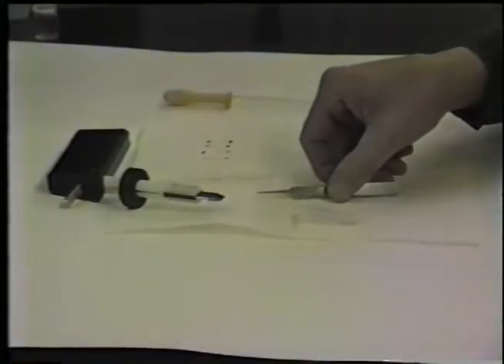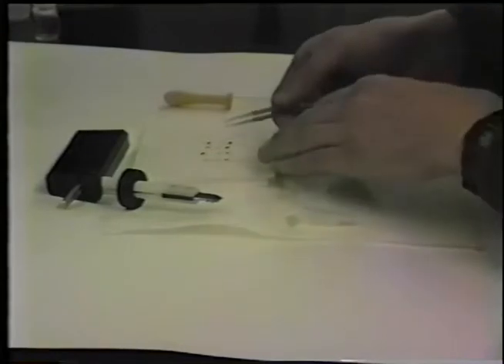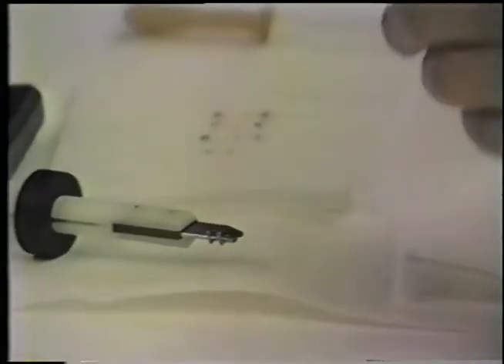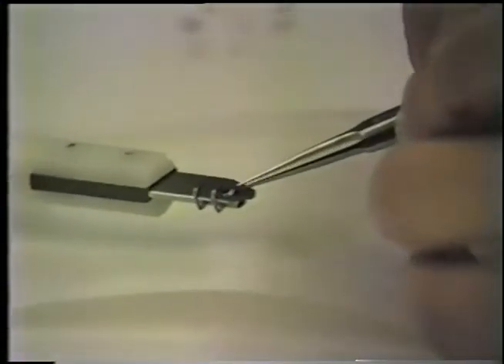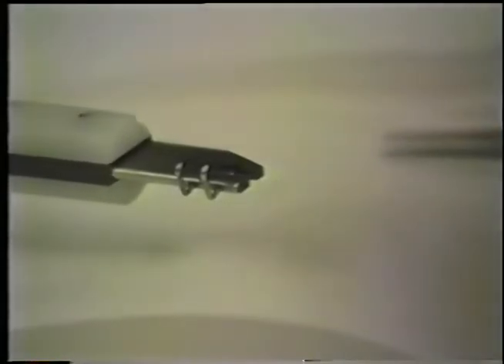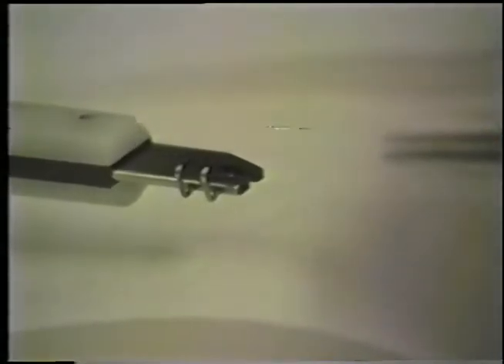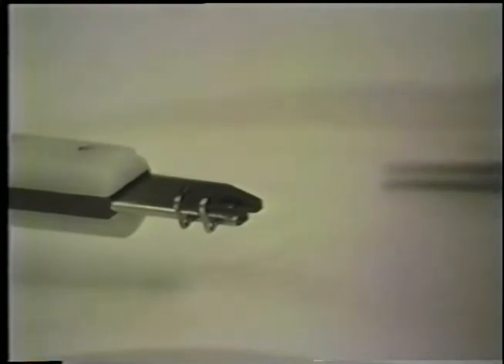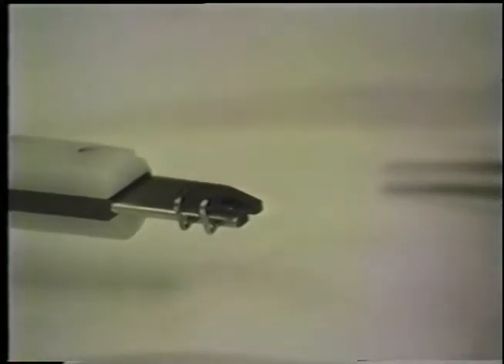To prepare a sample for freezing, first pick up one of the metal specimen carriers and place it in the sample holder. We then get a small aliquot of the sample with the Pasteur pipette and apply it to the specimen carrier.